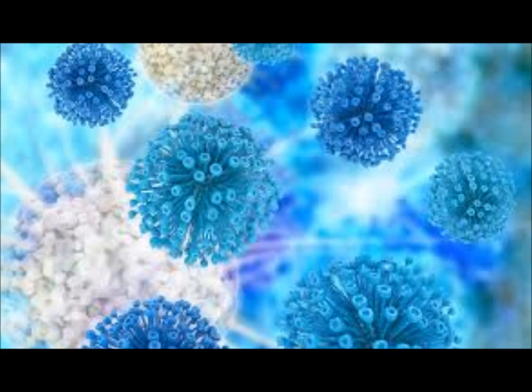Tell me, what do you think you'll see on a gram stain if you've gotten saliva that might have contents from your mouth? Besides bacteria. Think of a cell you might see if it's truly from your mouth area, saliva. And it's something you're going to have to do on every sputum to see if it's acceptable.